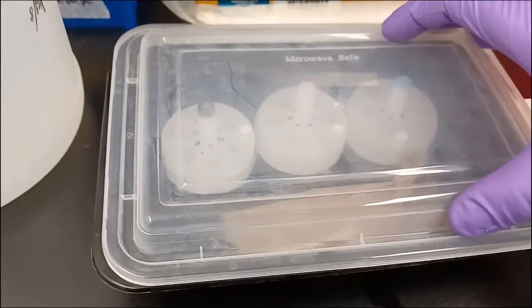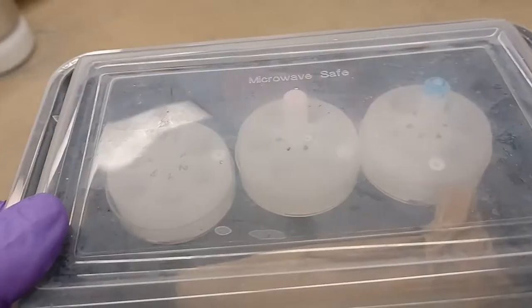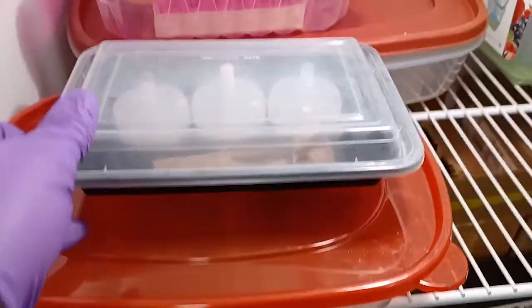Now, add the storage container lid on and then press it on to seal it. Then, carefully move this storage container to an even surface in the fridge, making sure not to tilt the container while you are transporting it.